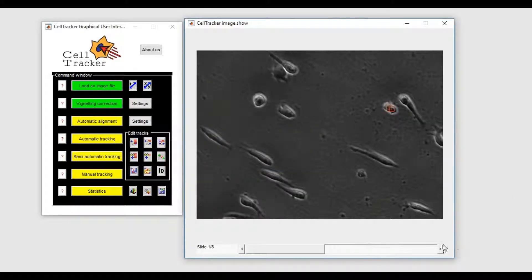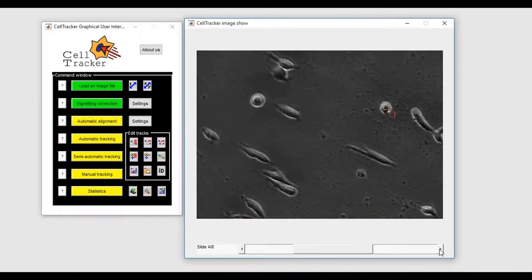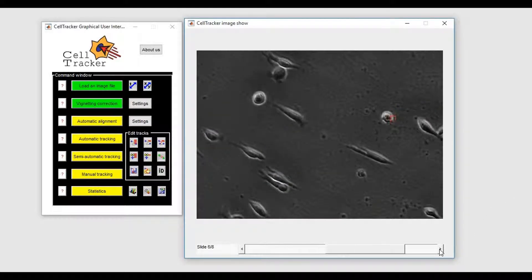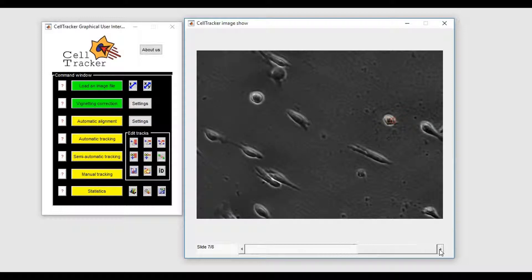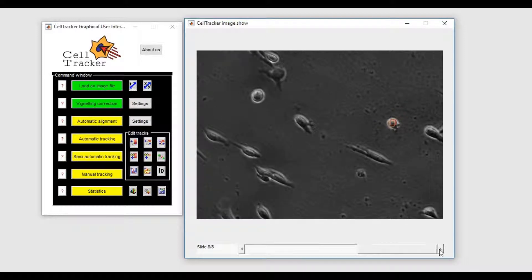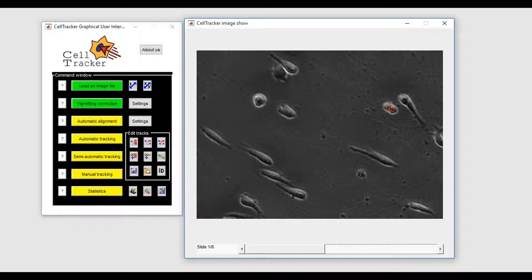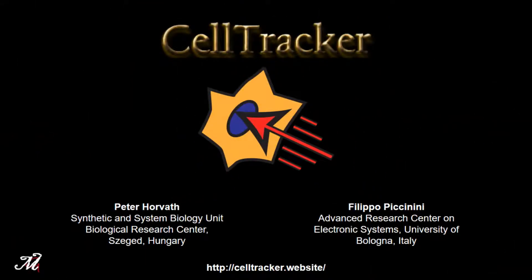As a conclusion, CellTracker offers a wide range of opportunities to track cells. Take your time to check which modality provides you the best results. Thank you for your attention.